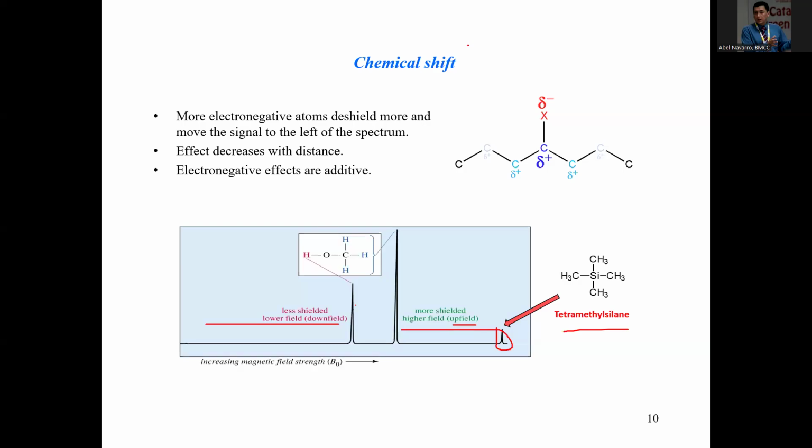What it really means is that you have an internal standard. So how does that work? Well, you prepare your sample. Let's say you synthesize aspirin or Tylenol today, and you put a little bit of that powder in a solvent. That solvent should be NMR inactive, having deuterium inside, so your sample is the only one responding to the magnetic field. Then you add a tiny bit of the internal standard. That internal standard helps you move the ruler to 0.